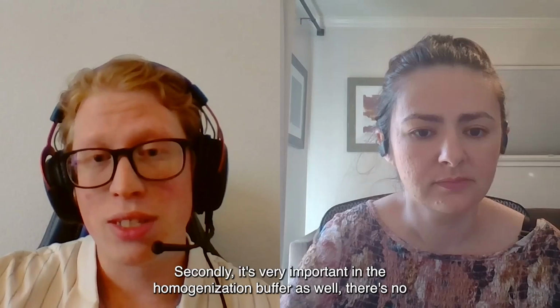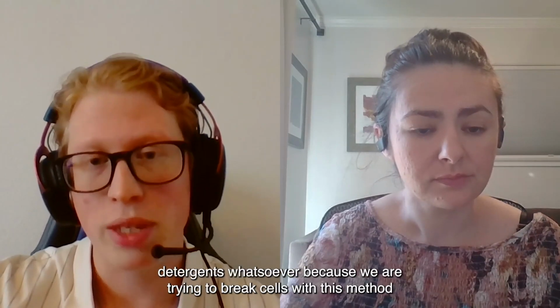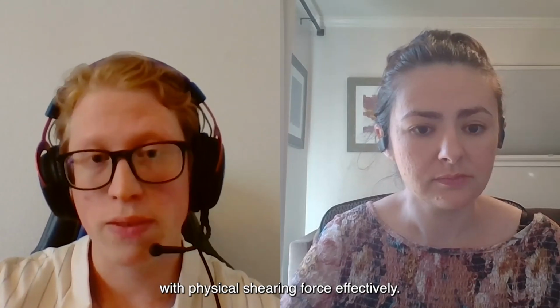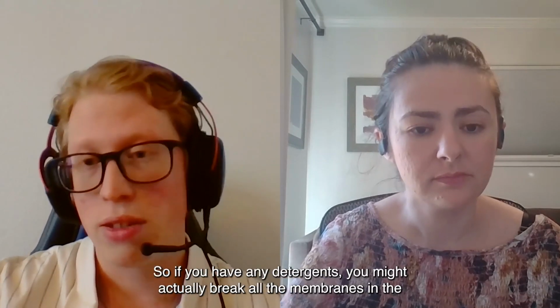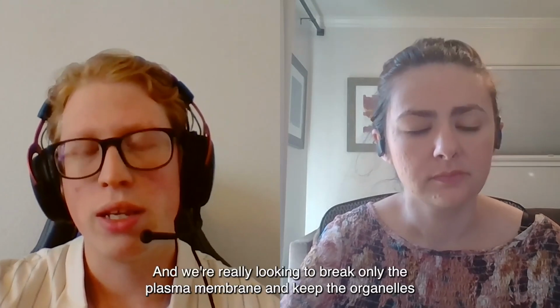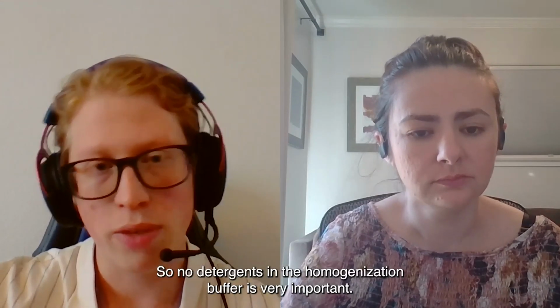Secondly, it's very important that in the homogenization buffer as well, there are no detergents whatsoever, because we are trying to break cells with this method with physical shearing force effectively. If you have any detergents, you might actually break all the membranes in the cell, and we're really looking to break only the plasma membrane and keep the organelles intact. So no detergents in the homogenization buffer is very important.